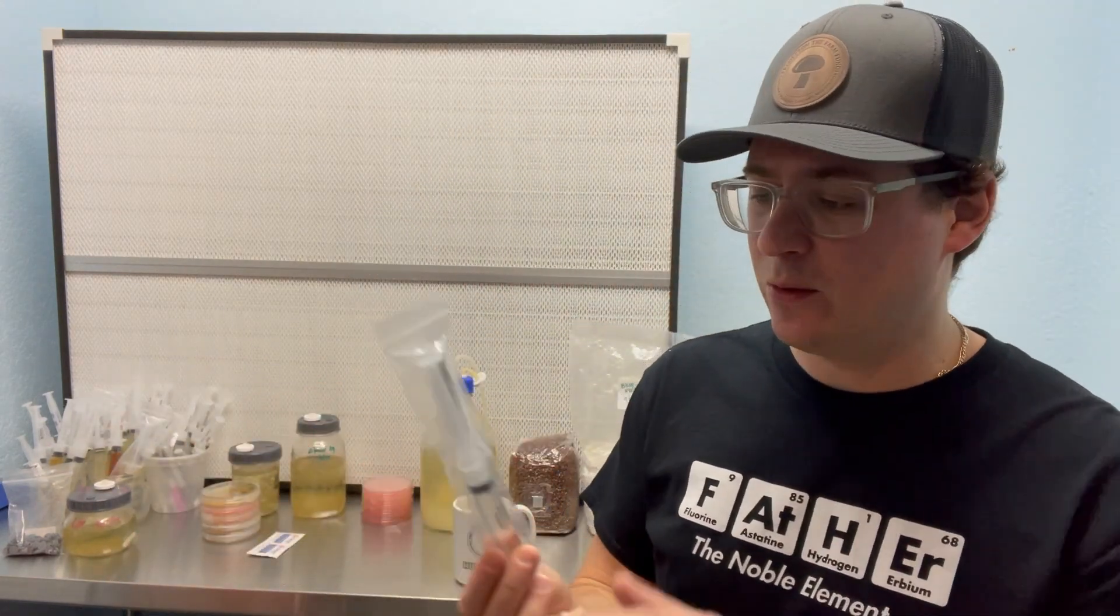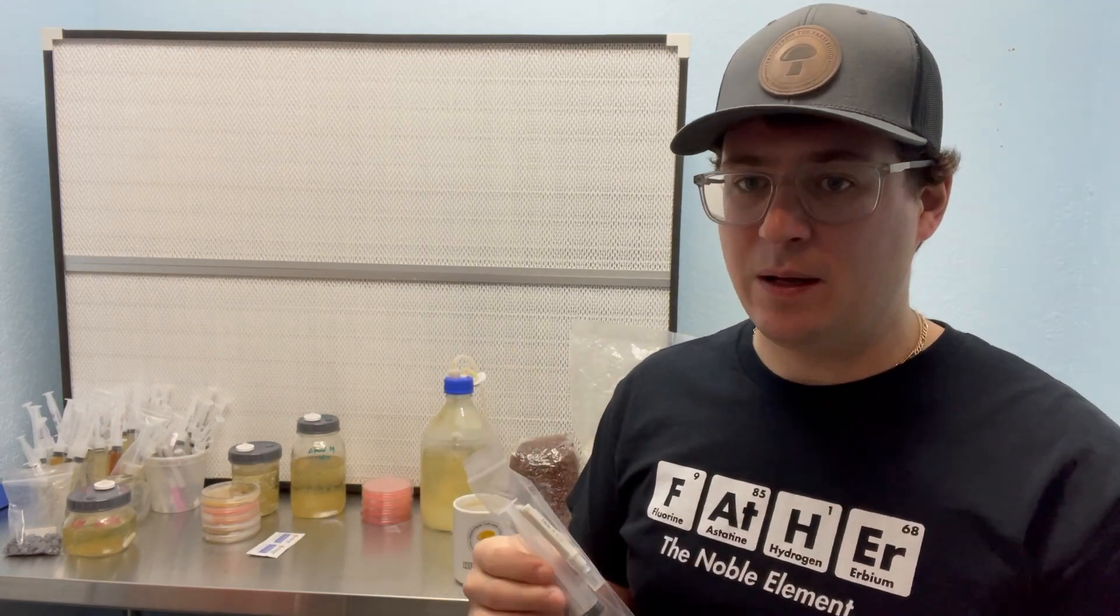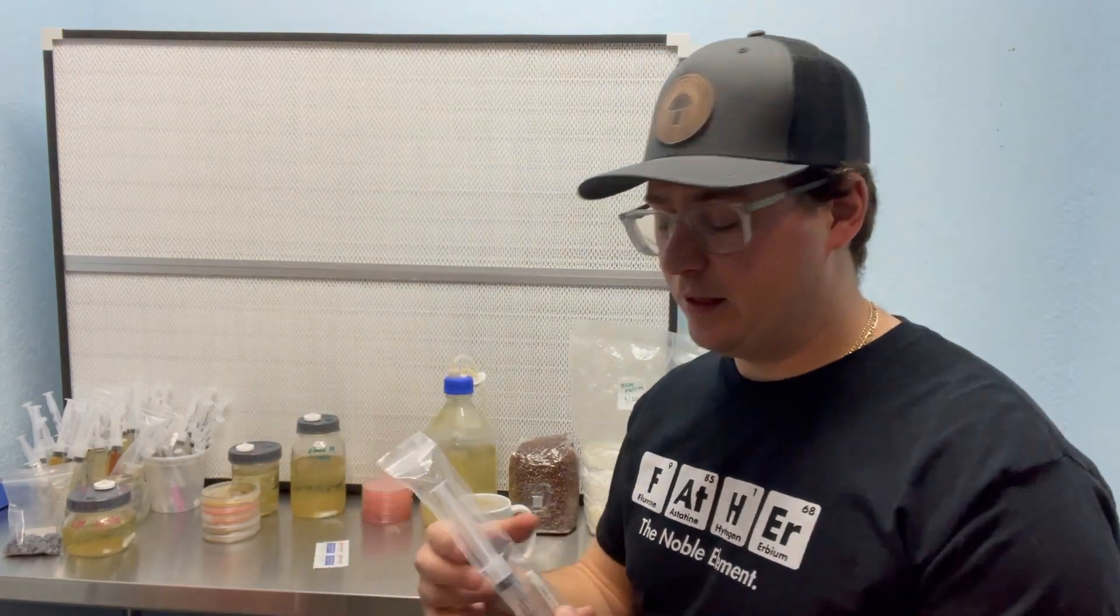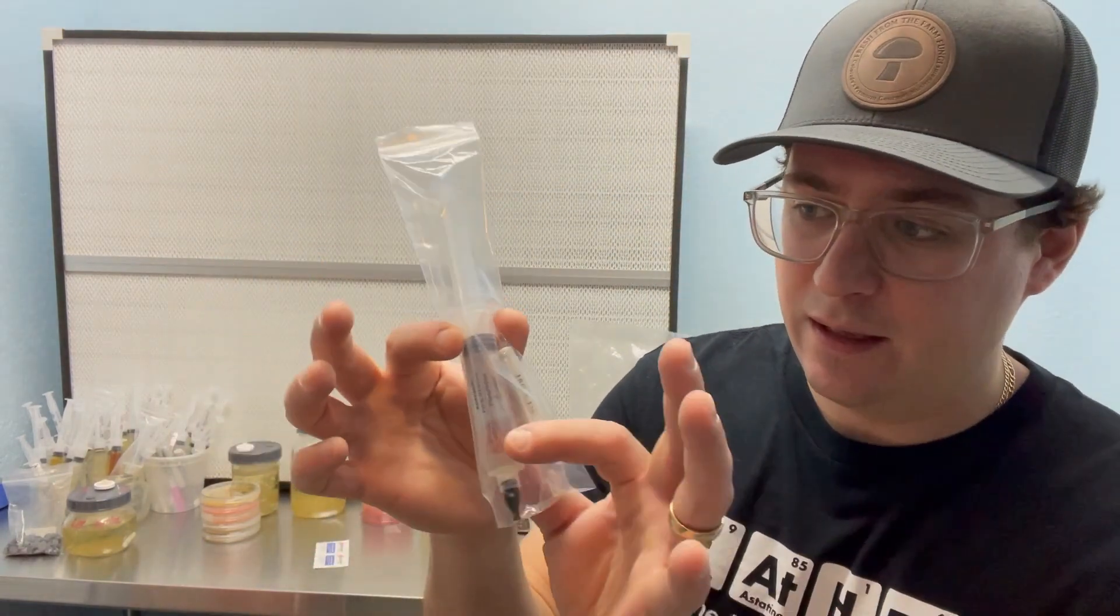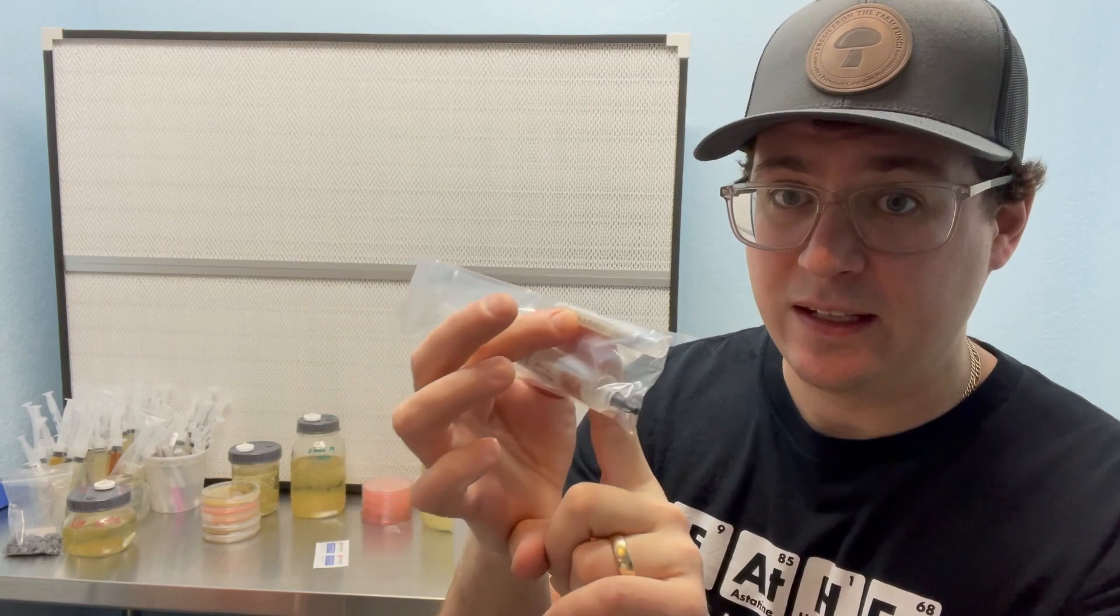So when you receive a liquid culture, you can get these from our Etsy shop or a number of different reliable vendors in the industry. Basically what you're receiving is a starter culture that is sterile with only mushroom mycelium. Sometimes these will come with alcohol wipes, but usually they'll come in a package like this with a sterile syringe and a sterile needle.